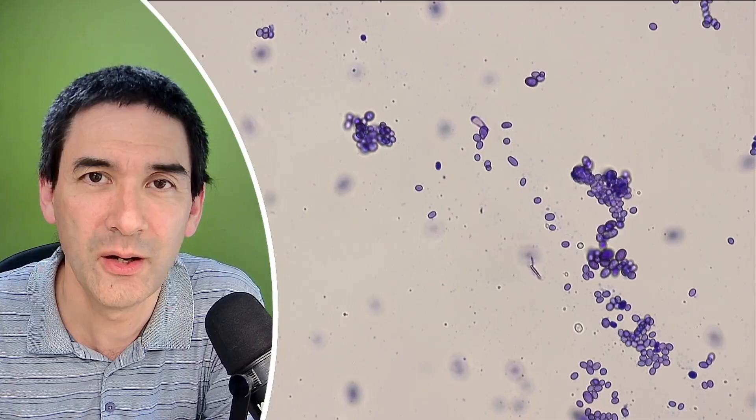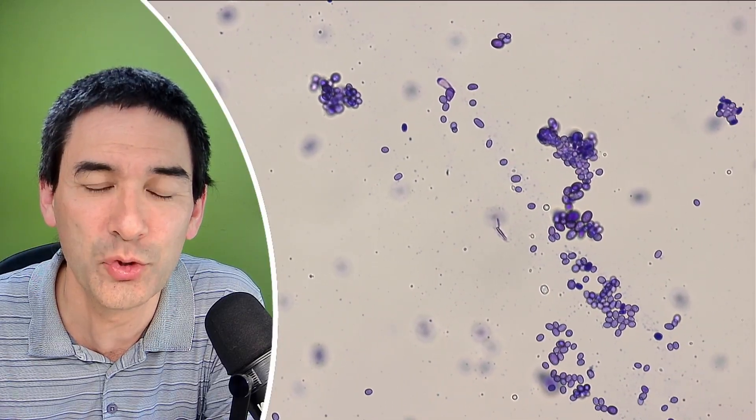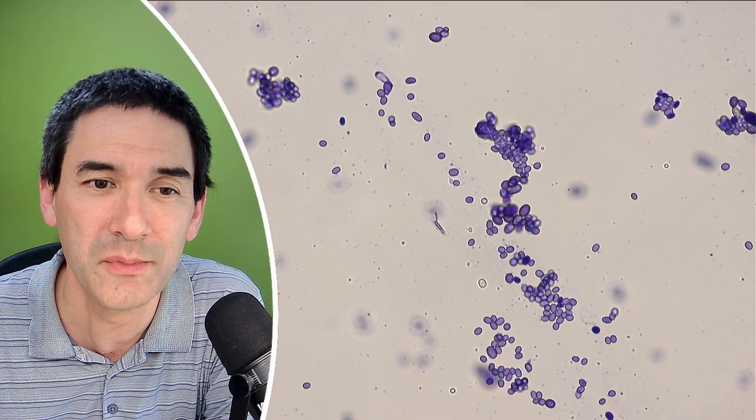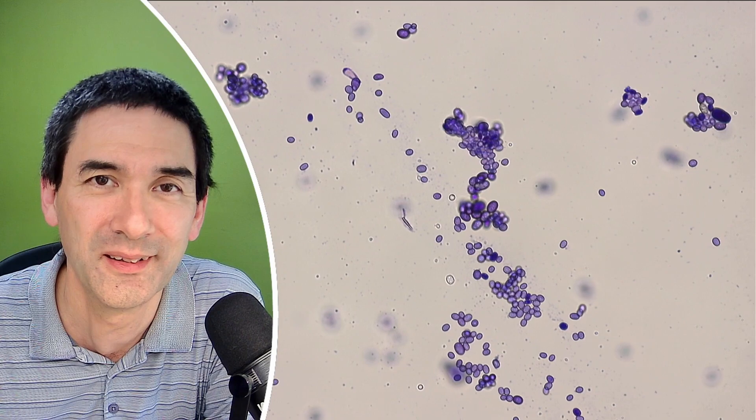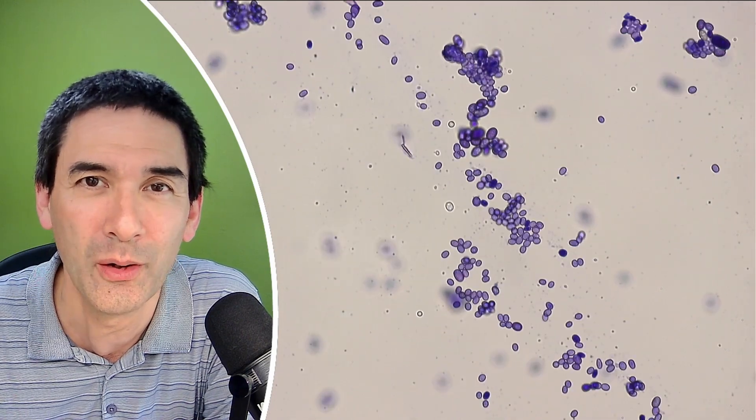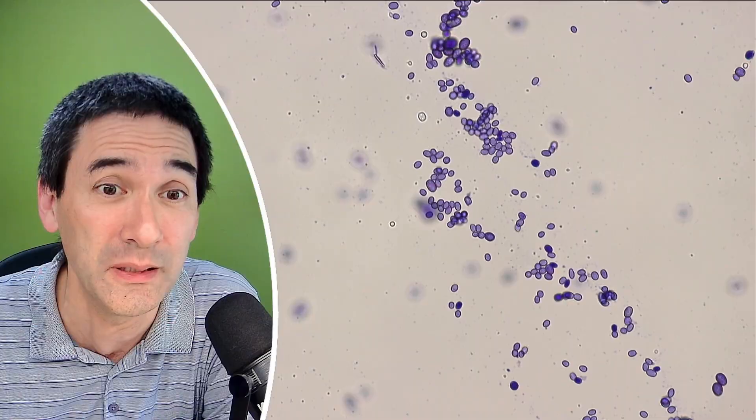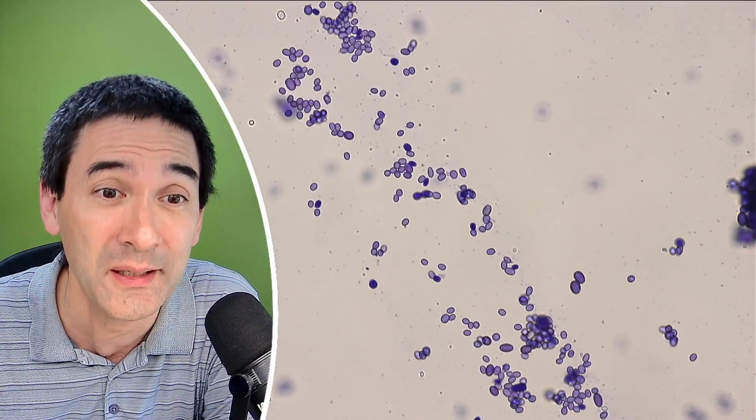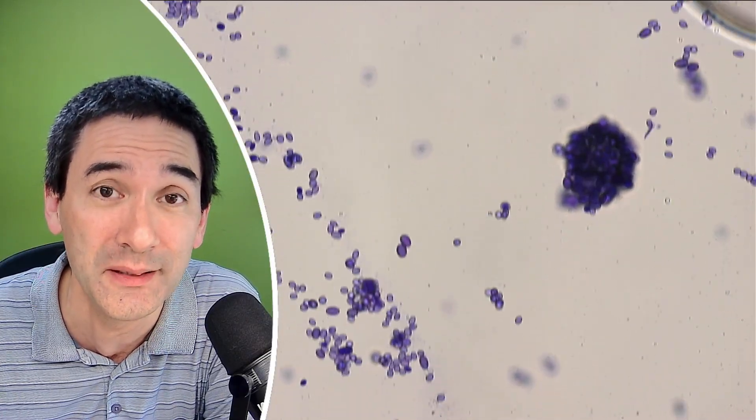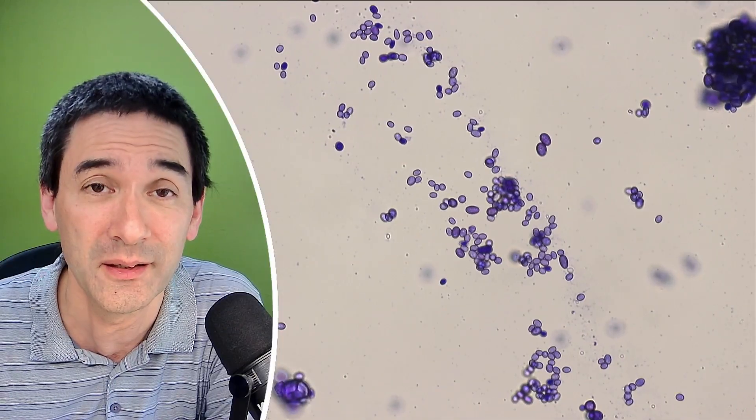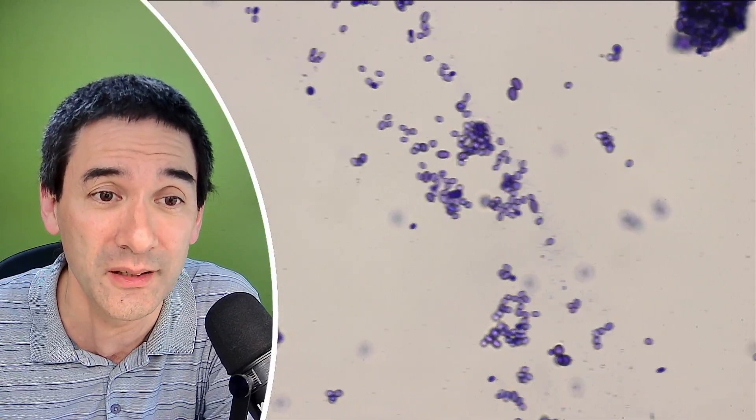So this is now using the 60 times objective and I think it becomes very clear now that the spores are now much better visible to the background. The background is now completely, almost completely white. However, the spores have retained the pigment, the stain and this is basically how it looks like.